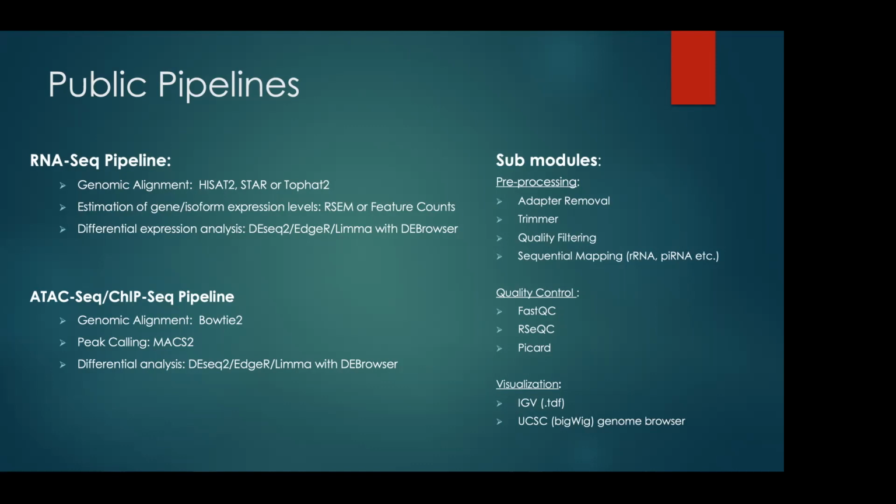So you will get a consolidated table in the report section. For the gene expression levels, you can use RSEM or featureCounts. In our last session, we used RSEM to get expression count tables, so you can do the same thing with DolphinNext. And after the RSEM analysis, you can do differential expression analysis in our report section by using DEBrowser.